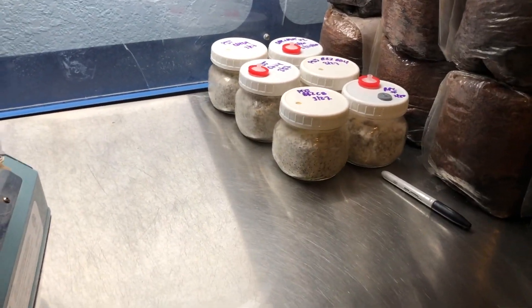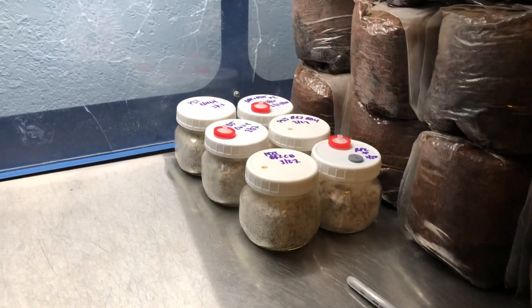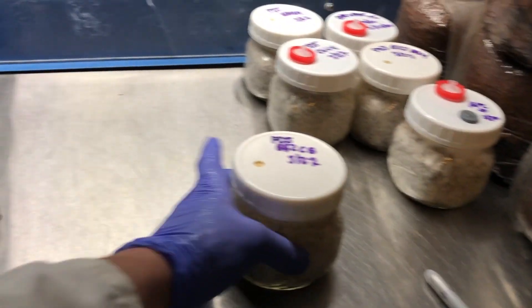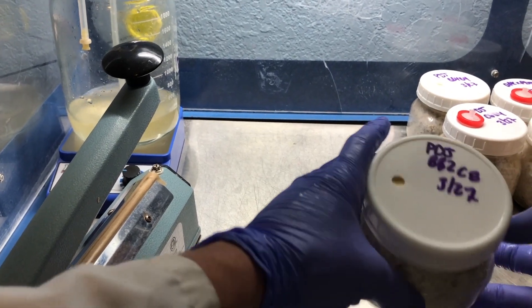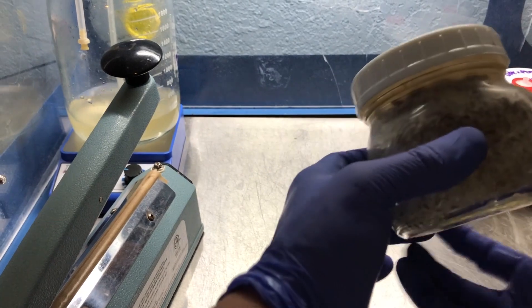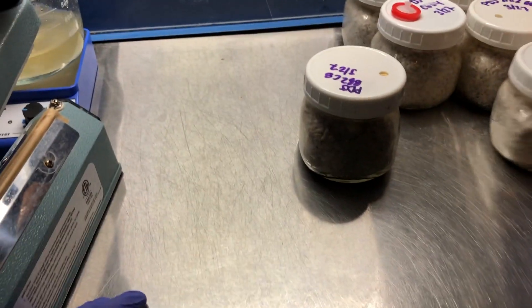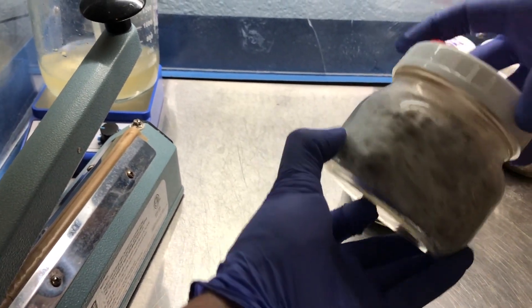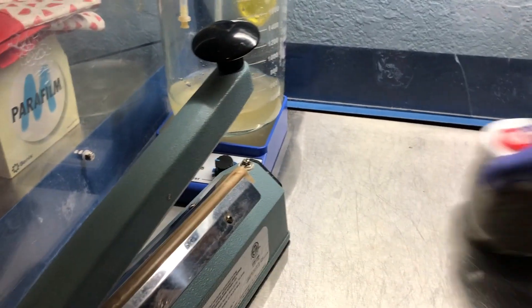I've got my workstation set up here — I've got my marker to label, all my cooled bags, and my heat sealer. These are all my crosses. This one is PDJ, so pink oyster BB2 C8 from two weeks ago — you can see how strong that mycelium is. I've also got the black pearl king from a spore solution liquid culture.